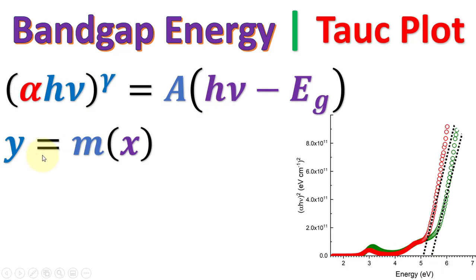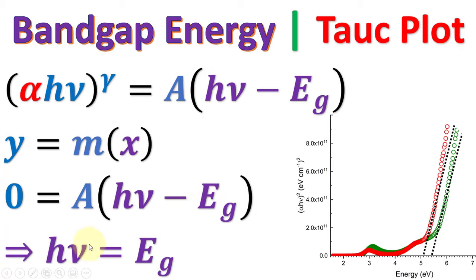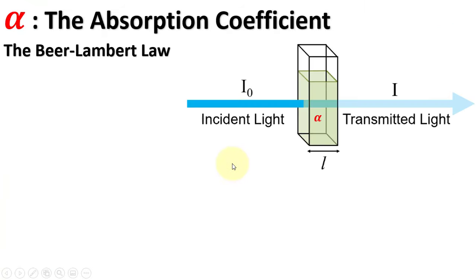If we compare the Tauc equation with the straight line equation, putting the y-axis equal to 0 will bring us to the x-axis. Solving for the energy, the extrapolation of the linear region of the plot onto the x-axis gives the band gap or edge energy. In this equation, we will first understand the absorption coefficient alpha.